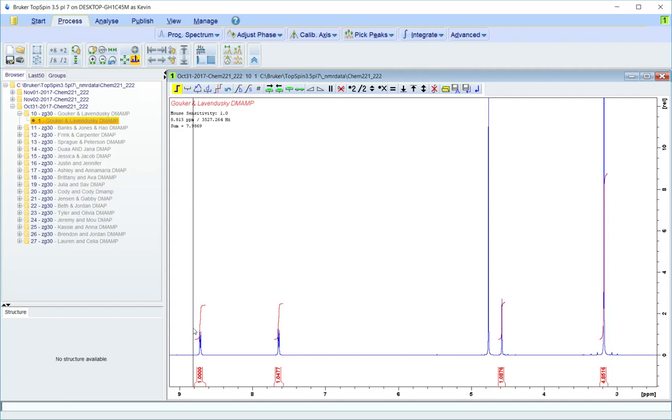Okay. So if your predicted product had some type of aromatic ring like that in it, you could then think about, okay, I've got 2 peaks in this area, so how many total protons do I have on that aromatic ring? In this case, it's 2, but maybe that's not the right answer.